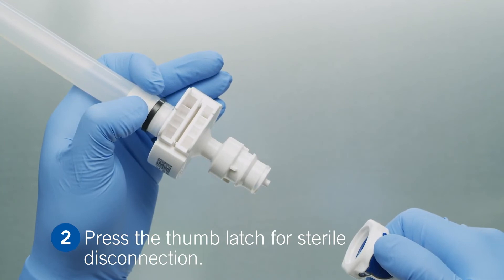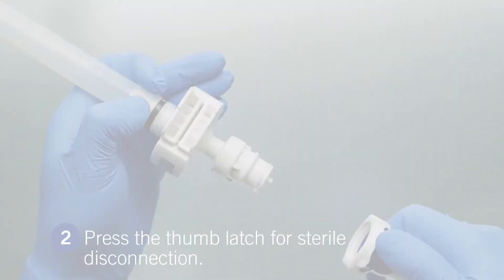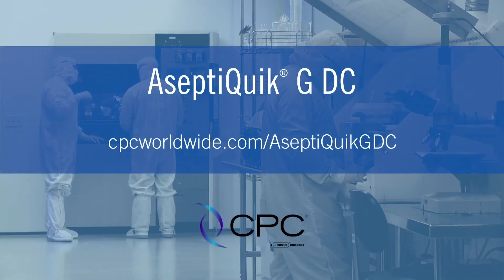Congratulations! You have completed sterile connection and disconnection. For further details on the assembly process, please visit our website. Thank you for choosing CPC.